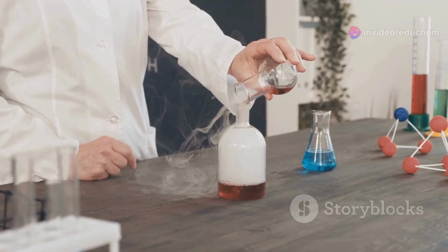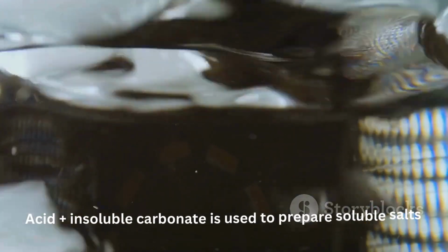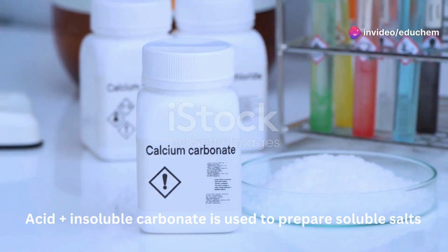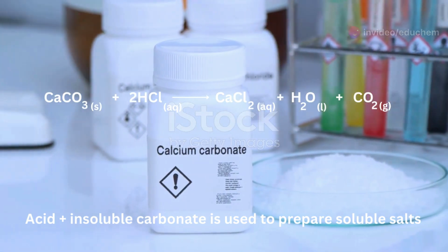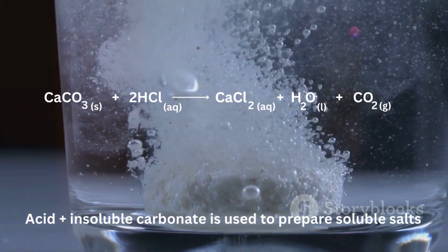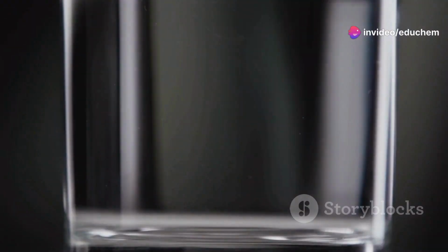Lastly, we have the reaction of an acid with an insoluble carbonate. This method is similar to the reaction with an insoluble base, but it also releases carbon dioxide gas. For example, the preparation of calcium chloride can be performed by reacting calcium carbonate with hydrochloric acid. This produces calcium chloride, water, and carbon dioxide gas. The steps for this method are as follows.